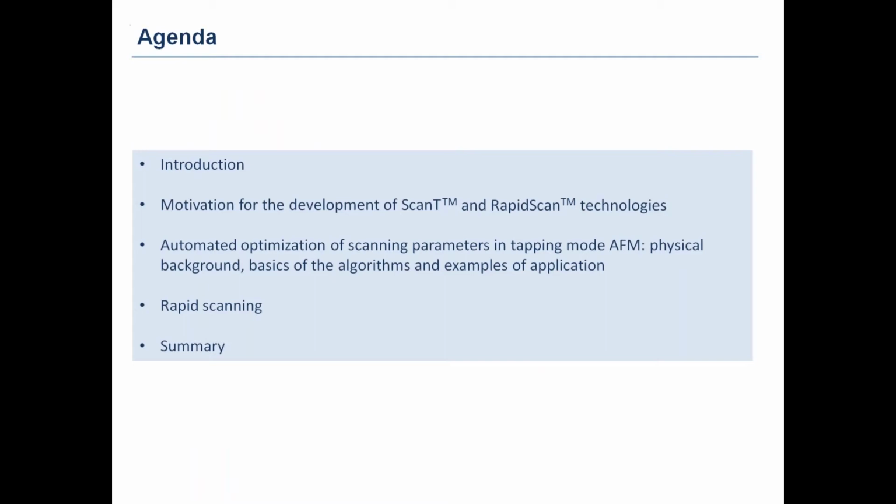Then we will move to the main part of the talk, which refers to automated optimization of scanning parameters in tapping mode AFM. We will consider the physical background, basics of algorithms, and examples of applications of the recently developed ScanT technology. Then we will go to rapid scanning and introduce the rapid scan technology, and make some conclusions about today's presentation. So let's get started with a brief introduction.